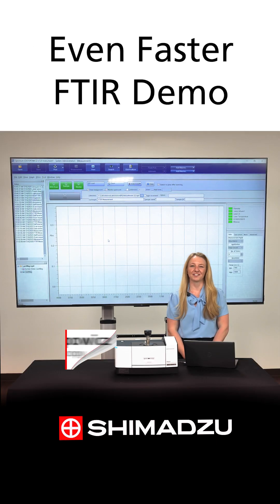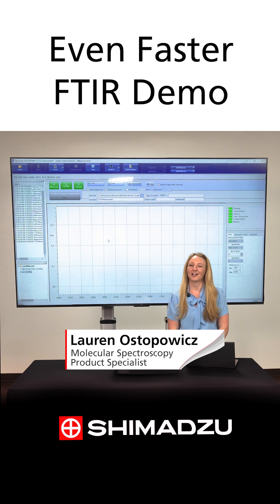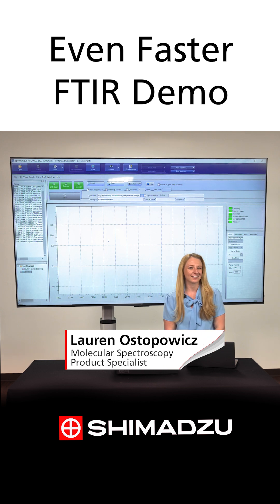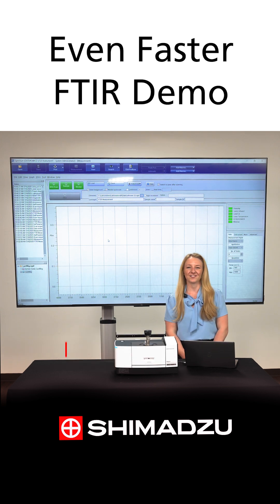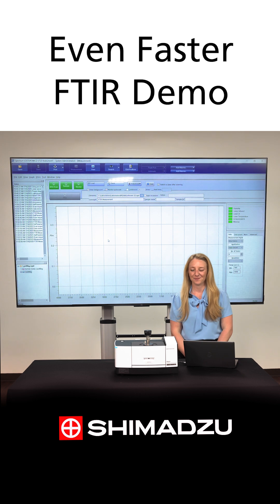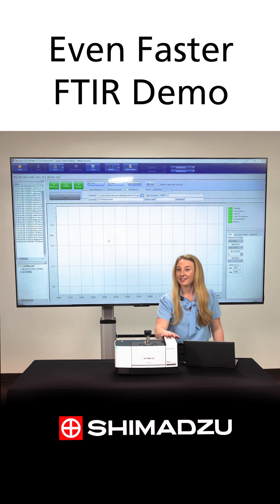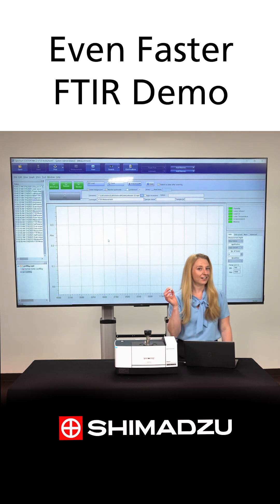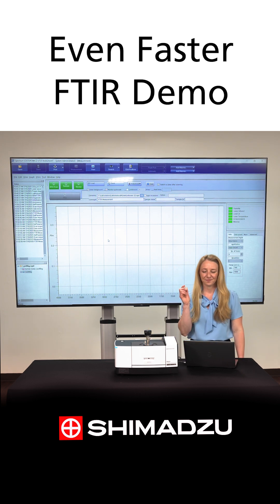Hi, I'm Lauren Ostapovich, the Molecular Spectroscopy Product Specialist here at Shimadzu Scientific Instruments. Thanks for joining us on this fast FTIR demo. I'm working with the IR Spirit to identify our unknown sample.